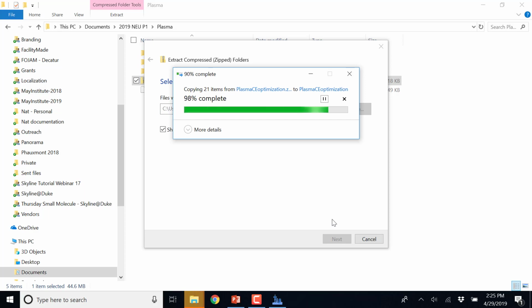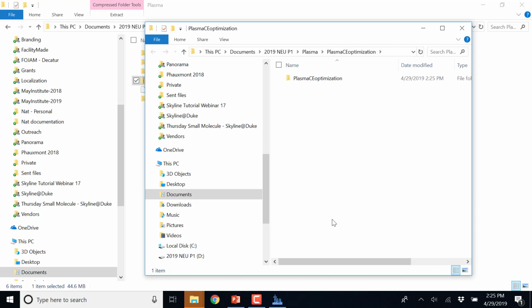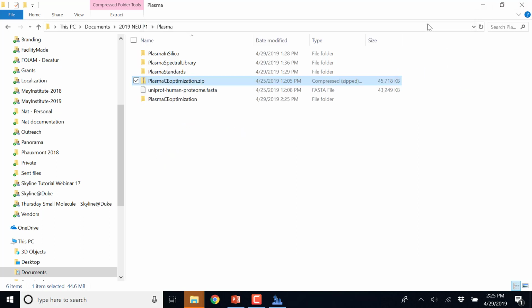While this is happening, I have a possibly silly question. In the first example that we were doing where we wrote in the peptide, how do you populate the window showing the chromatograms? Right now I just have my MRM traces.